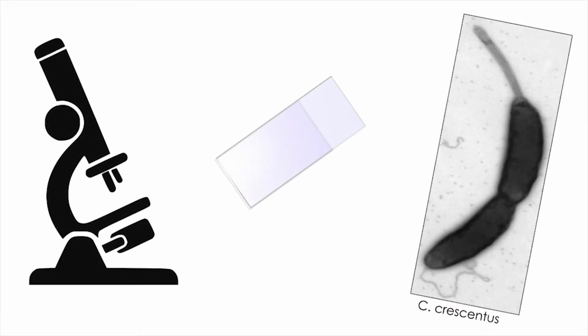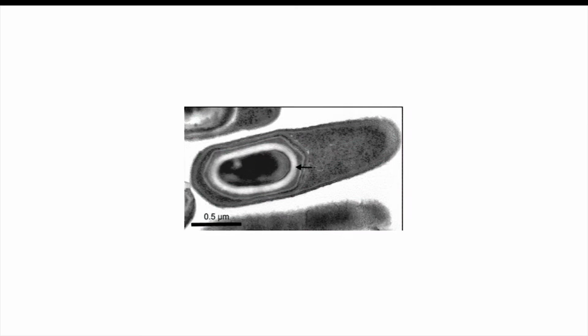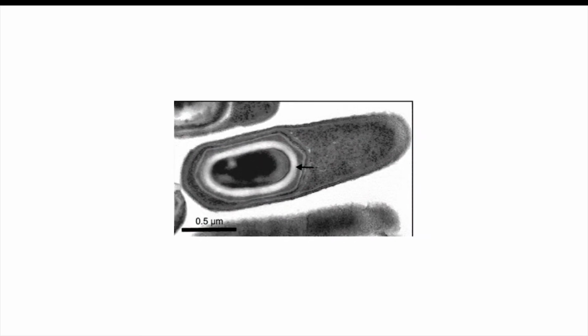I'm interested in bacterial anatomy, so I'm both a microbiologist and a cell biologist. And the question that we're primarily interested in is how these very small organisms are organized, all the way down from the scale of individual proteins out to the whole organism. So we'll start out by putting the cells onto a flat surface, focusing the objective lens so that we can see these bacteria and the anatomical features within them.